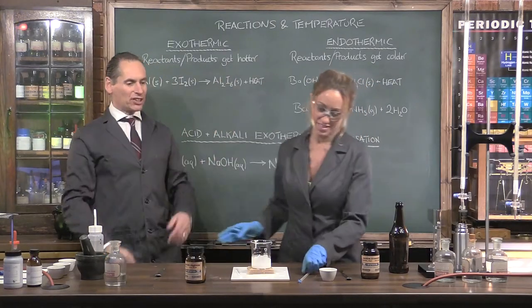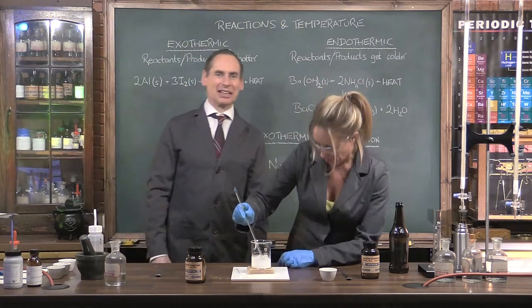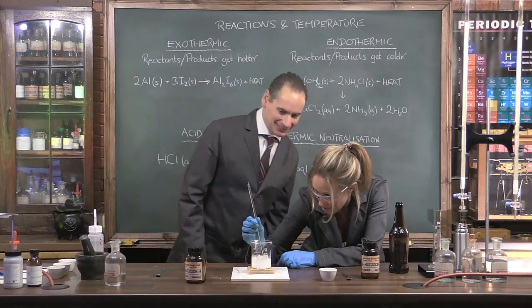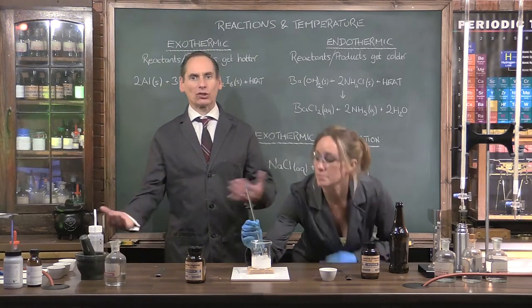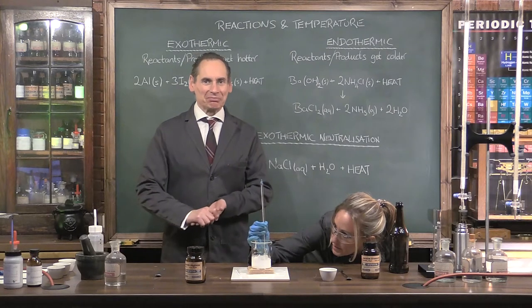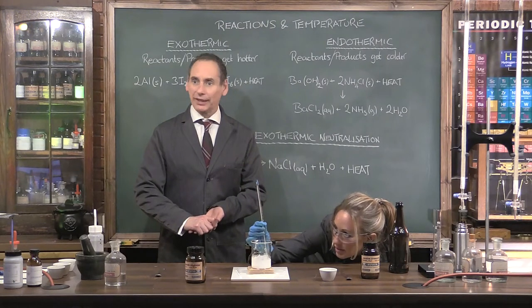Now, let's measure the temperature. Let's see what we've got. Right. There we are. So it's smoky. So it's dropping down quite rapidly. Almost at zero, but it was at just under 20. Yeah, we're about 20 here in the Geeknik lab at the moment as we speak. Where are we now? What temperature are we doing? Drop down to zero. And we're still going. Yes.